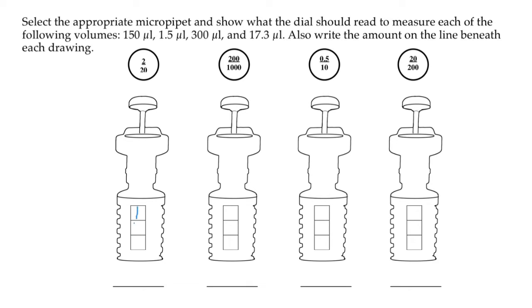17.3. So it's going to be in a different color. So this means 17.3. So 17.3 microliters. Next one is tricky.